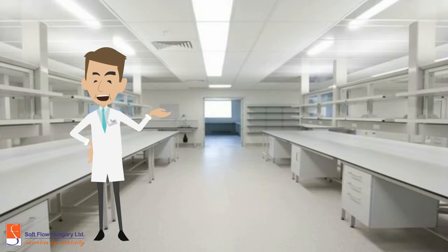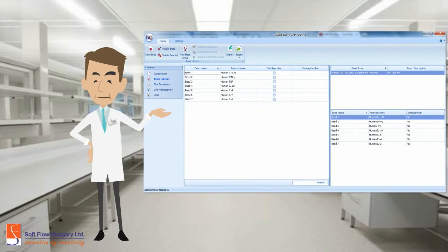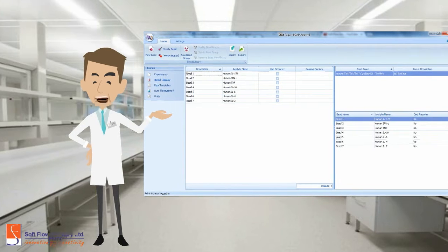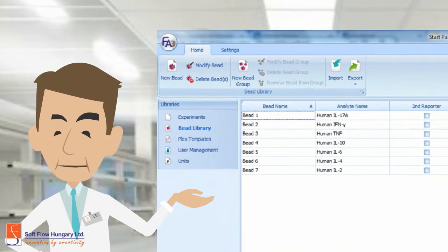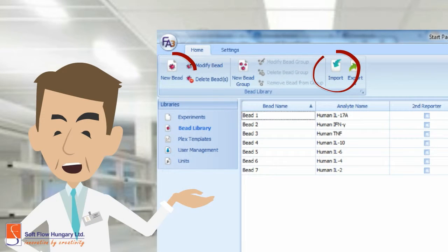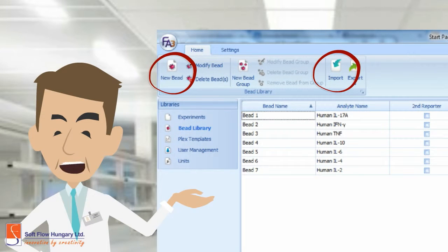Take a look on the screen. In the menu, you can find the beads library session as well. In this area, you can select whether to import or to create new beads. Use the top menu for this.